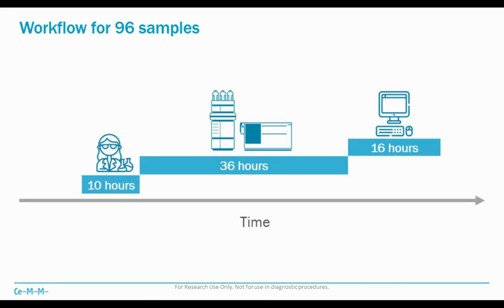And the final workflow provides us that we can analyze 96 samples within 4 days. So this is not the most high throughput assay, but as I said, the throughput is not the key here. It's really the robustness and the long-term performance.